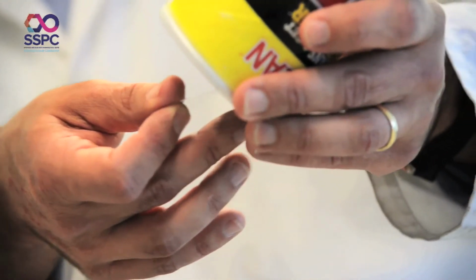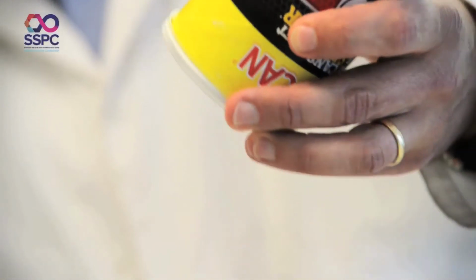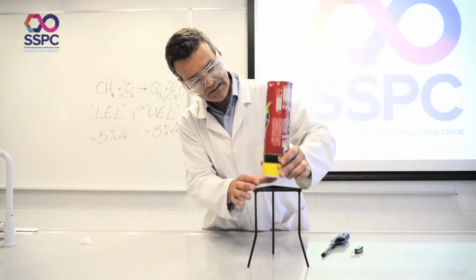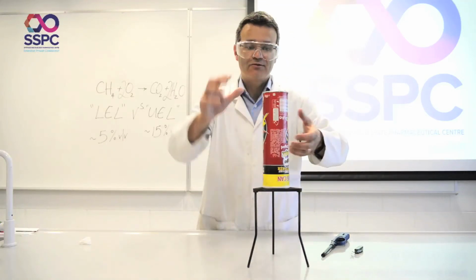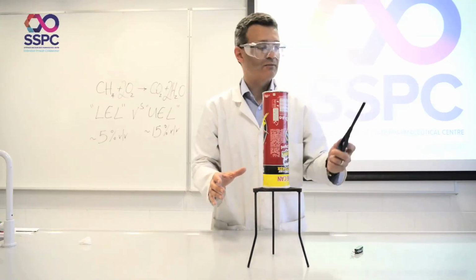Now I'll take the bottom piece of sellotape off with the tab that I've made. Okay, now the methane won't fall out the bottom because it's lighter than air. So as long as I hold it like this, nothing happens. The important thing is, be sure to put the plastic lid on the tripod. Don't light it the other way around, or the whole thing catches fire. Then I'll take the plastic off the top and light it promptly.